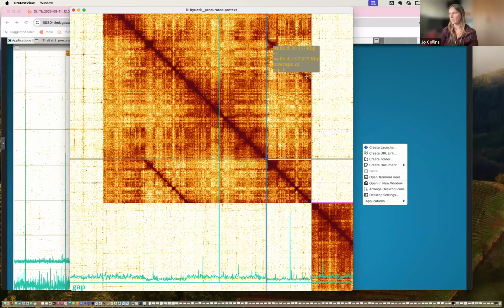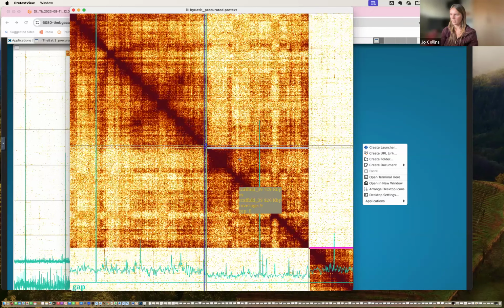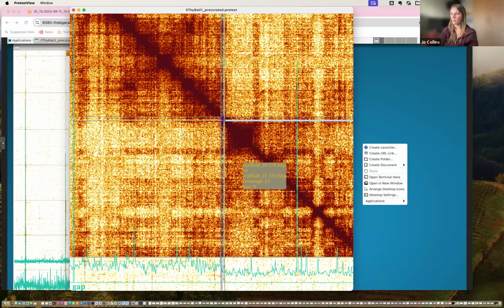We've got the really strong, clear diagonal line showing us the part of the chromosome that's duplicated. And if you look within the chromosome where that duplication is, we can see exactly as we saw before that the coverage over that location is halved, and that matches the half coverage of that entire scaffold. So we need to tag that scaffold up as hapdupe. And what we can see, I'm going to take my waymarker tag off now.